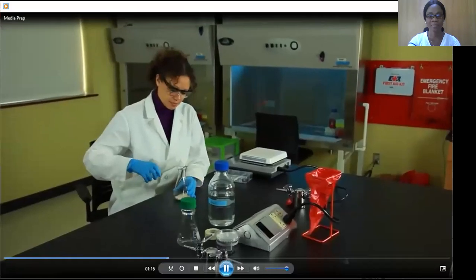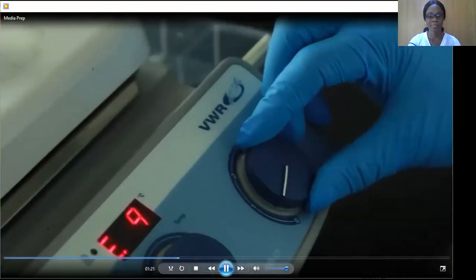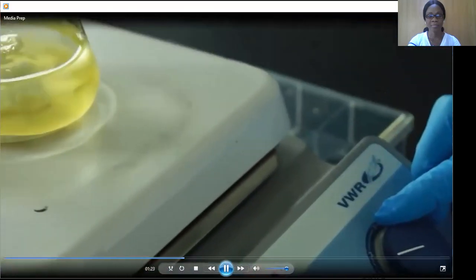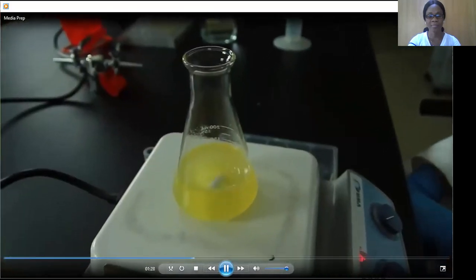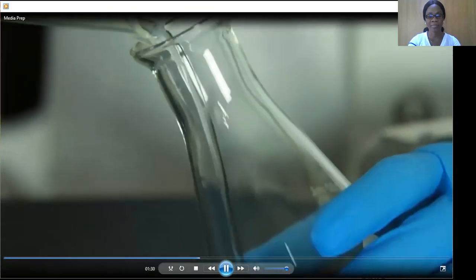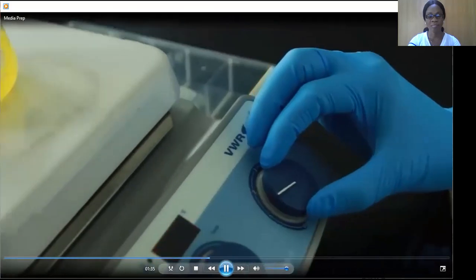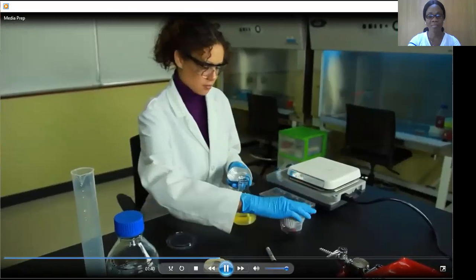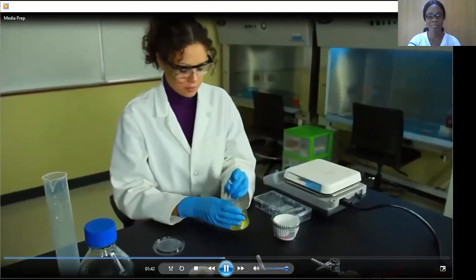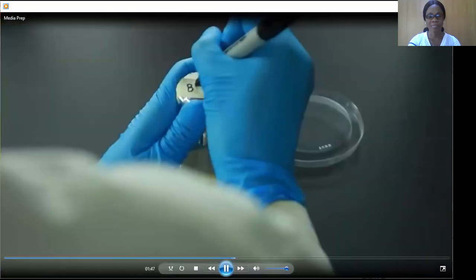Add about 75 milliliters of deionized water. Place the flask onto a stir plate. If you're using a combination hot plate and stir plate, be sure that the heat is turned off. After about 2 minutes, add the remaining 25 milliliters of water from the graduated cylinder. Stir the solution until all of the visible clumps have been broken down. Cover the flask with aluminum foil. We are using foil cupcake wrappers because they're the perfect size. Place a piece of autoclave tape over the foil and label it with the media name.